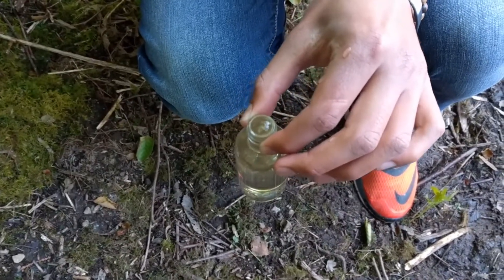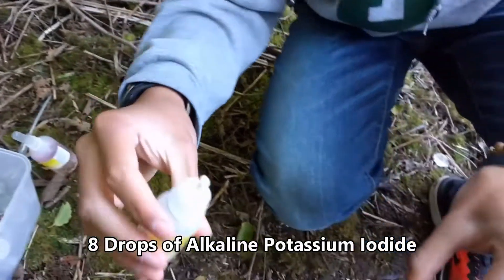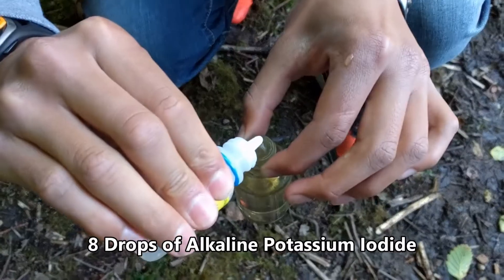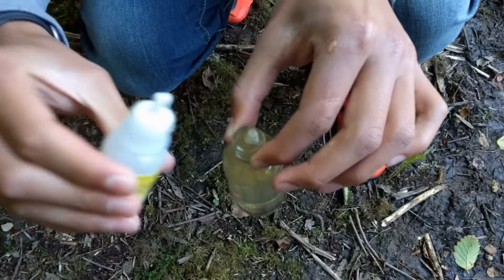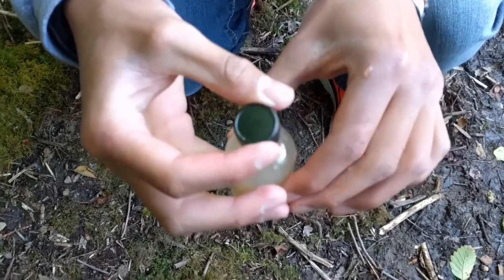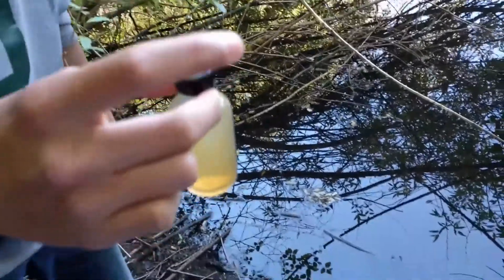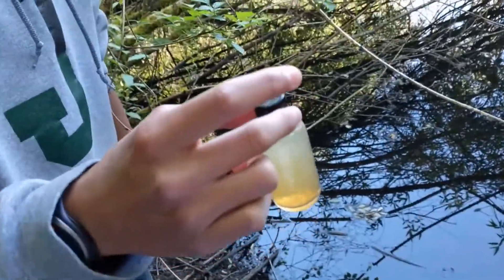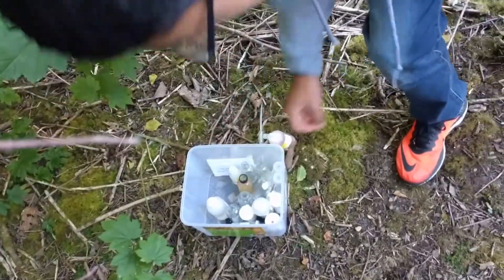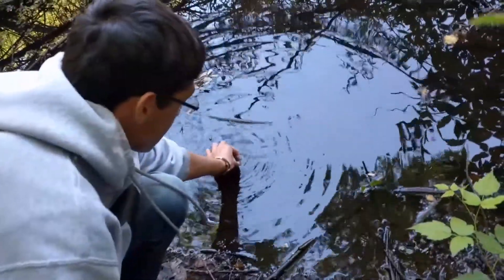Now we are adding 8 drops of Alkaline Potassium Iodide. Notice the solid precipitate that is forming, so we are going to mix it. This bottle we will take it back to measure for the initial dissolved oxygen level. And then next we go on and fill 5 of these bottles with more of the pond water for the next part of our experiment.